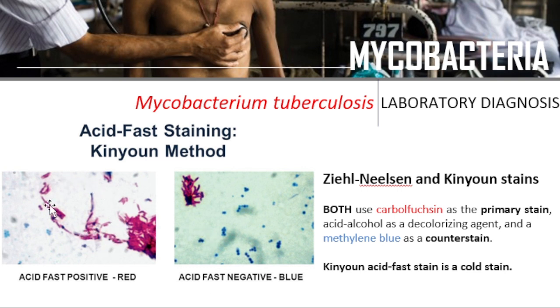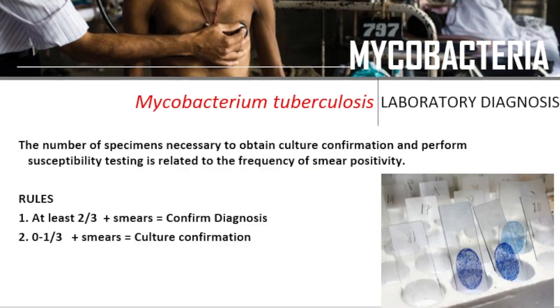So acid-fast bacilli are rods, slender, thin bacteria, and they are red. They are acid fast. So remember, like in cartoons with vehicles, they are fast cars. So the star here is the color red. So acid fast, they are red in staining.